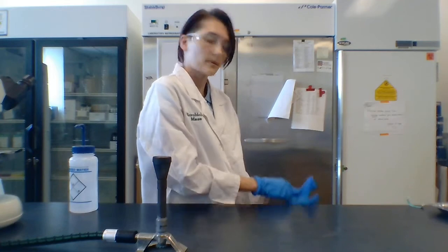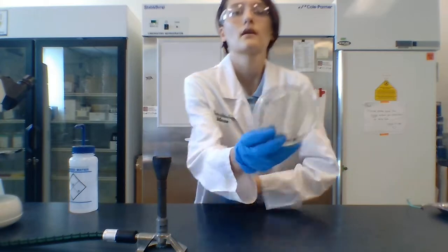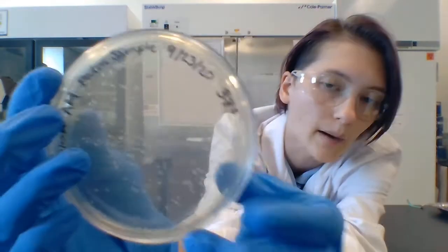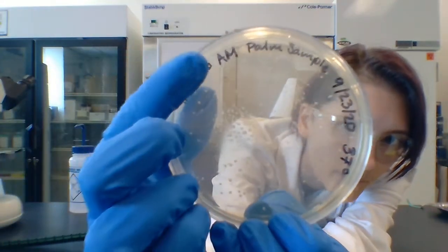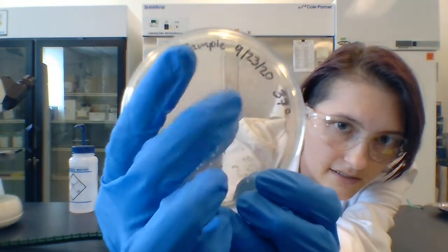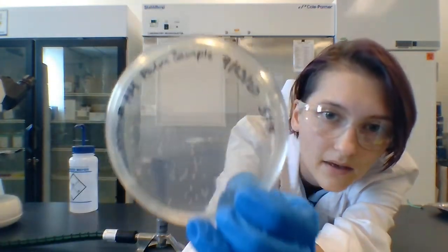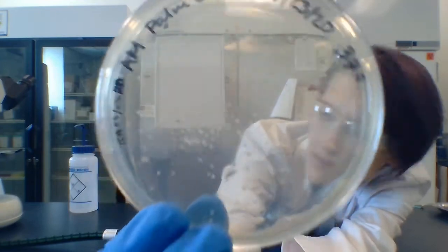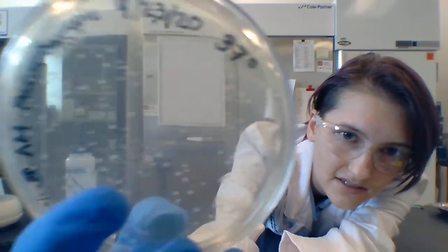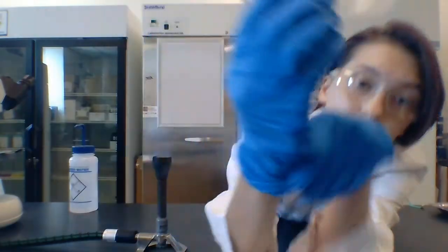And I've already incubated a plate for you guys to look at. So here is a plate from earlier with my palm germs. So I've labeled the plate properly with my initials, with where I got the sample from, the date I took it, and the temperature that it incubated at. If you notice, that is body temperature. So you can see these germs are all of the little spots. So those are like little cities of bacteria where they've grown and they're flourishing.